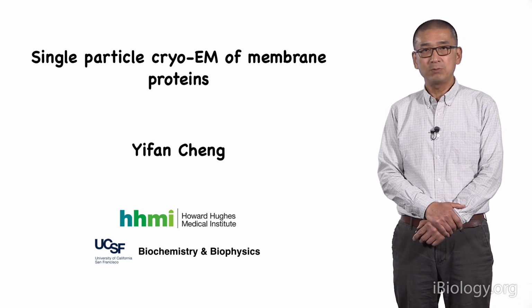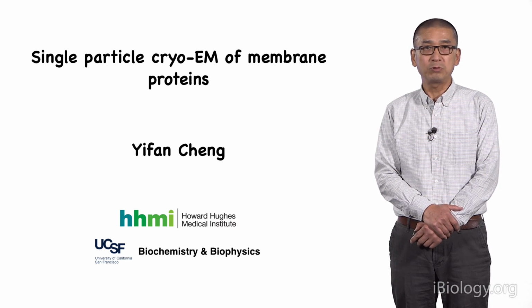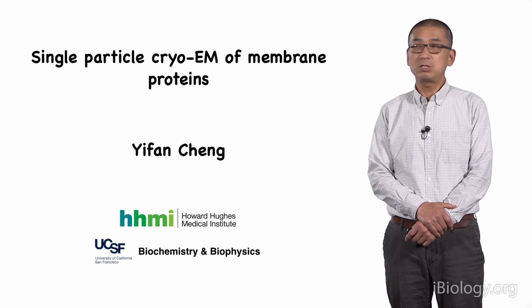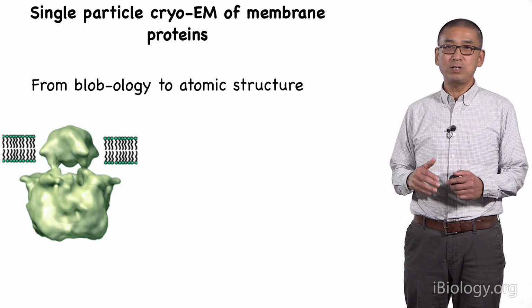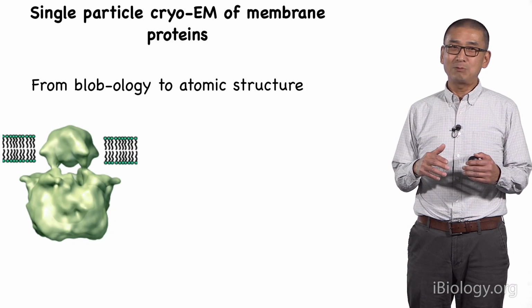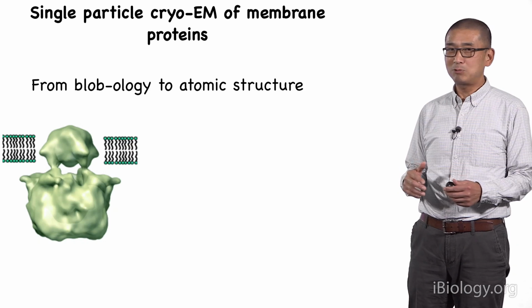And here I'm going to mostly focus on the work related to my own laboratory, and particularly our efforts to use single particle cryo-EM to study integral membrane proteins. For a number of years, our effort has been trying to bring single particle EM of membrane proteins from a blobology level to atomic resolution.